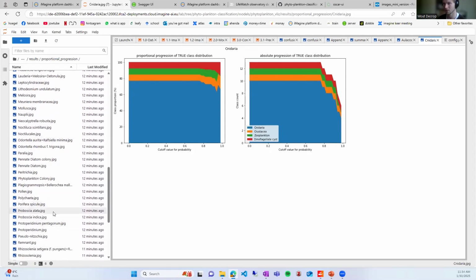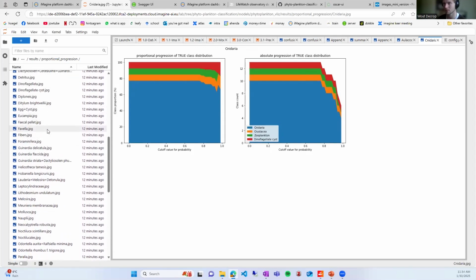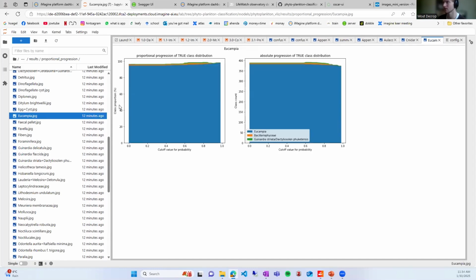And I'll take a look at maybe this one. So here you can say, or the user can decide for himself and look at this graph and think, okay, if we increase the cutoff ratio, we do get a higher performance. We almost get 100%. I think there are only a few misclassifications, but you can say for this 99% filter that we don't lose that much data, and the data that we do lose is the data from the misclassifications.